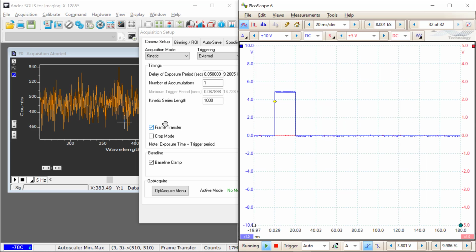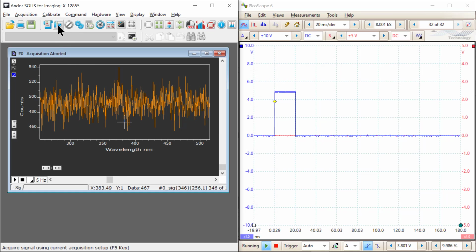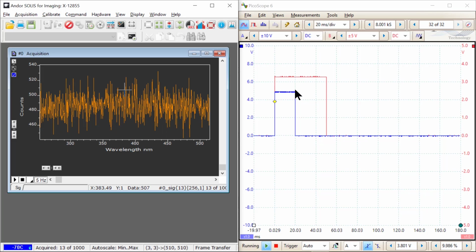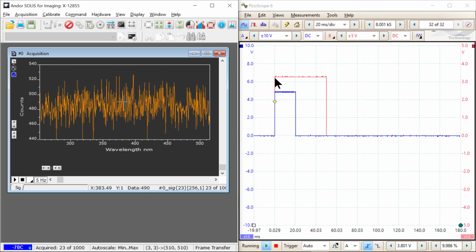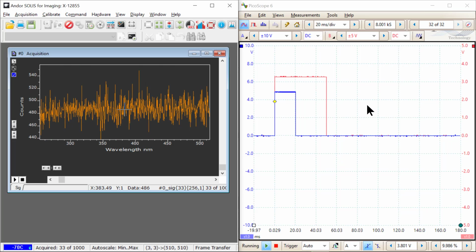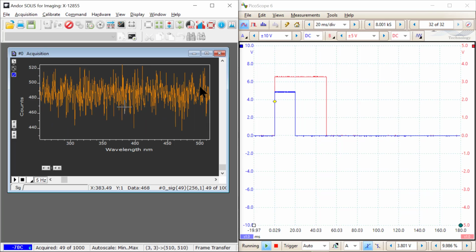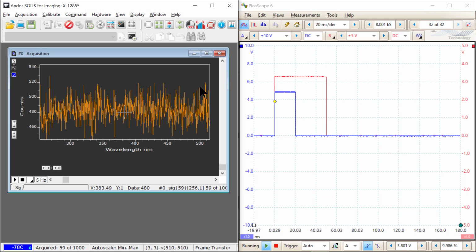And let's see what that means in terms of synchronization here. So now you can see that the exposure time, as each cycle goes, the exposure is here linked to the trigger. And nominally my exposure is whatever I set it to, 50 milliseconds. But really, I'm collecting light until the next trigger happens. There's something I do want to show, though, that's a little bit of an intricacy. And you're probably going to learn more than you wanted to necessarily even know about the triggering and the timing here.